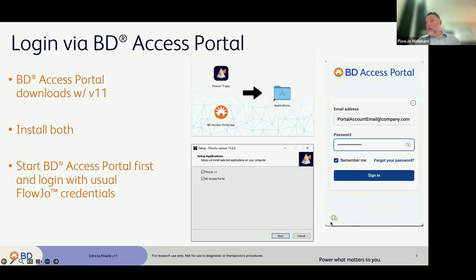If it's red, or in the first versions of this, yellow, it is not connecting to the server and it's being blocked by some IT security. And that could be a proxy, where you can enter proxy information by clicking these three dots, or it could be that your IT guys need to put in some sort of exception to allow the application to reach the internet through their security software. So again, green is good. If it's red or yellow, you've got some problem with the network blocking the communication and it's not going to work properly.